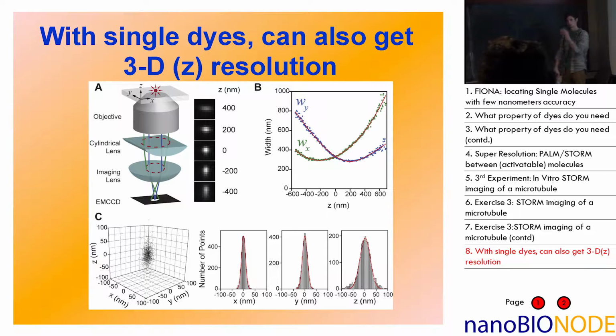So what is x and what is y? The x Gaussian and the y Gaussian are just the x and y projections, respectively. Is this the projection in the x direction? The axis would be intensity, and this would be bins or channel number, and you can convert that into meters or nanometers. So these are basically cross sections of a three-dimensional heat map. Right.